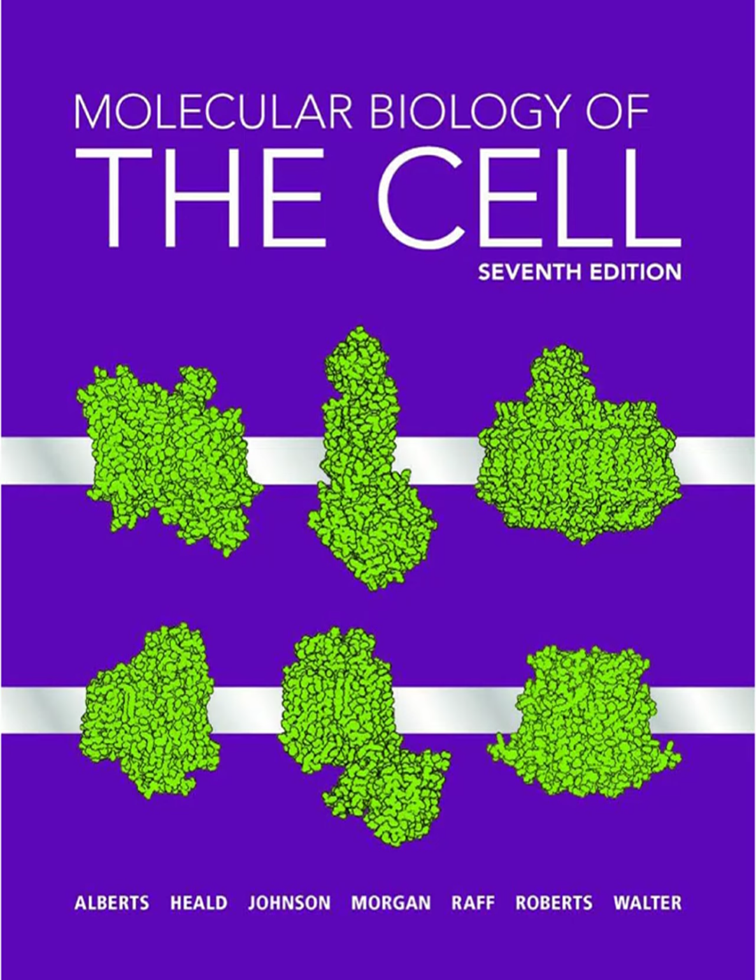Tons of things. One technique is in situ hybridization, or ISH. You use fluorescently labeled probes, usually short pieces of DNA or RNA, that are designed to bind specifically to certain RNA molecules within the cell or tissue. It lets you literally see where specific genes are being expressed. You can map out gene activity?